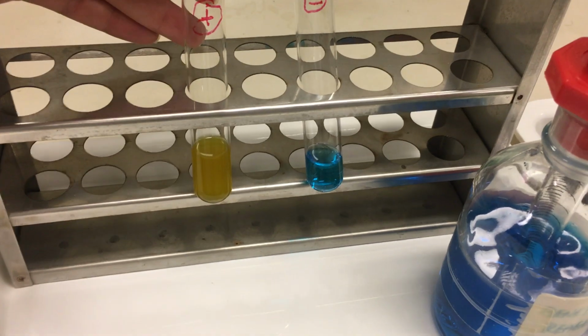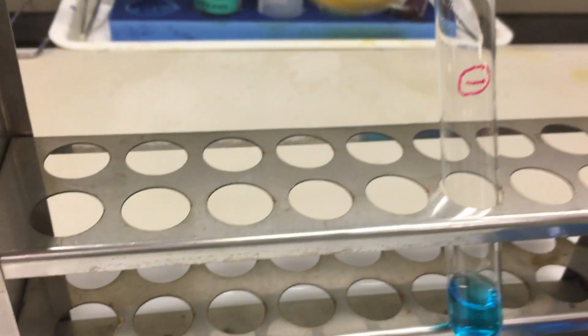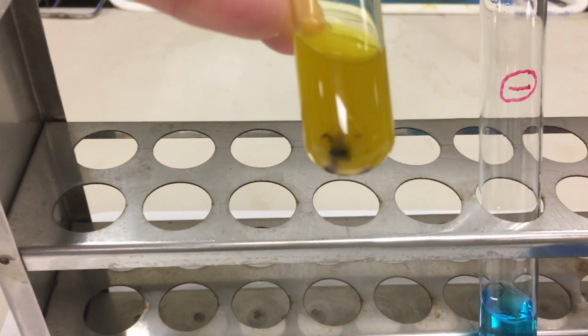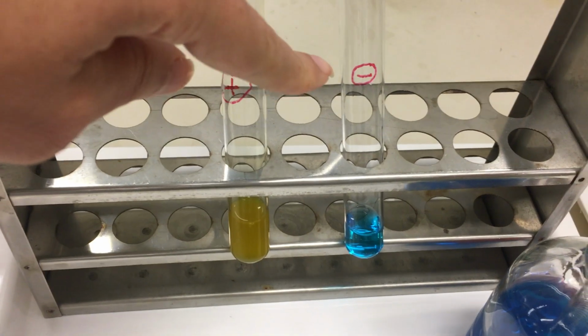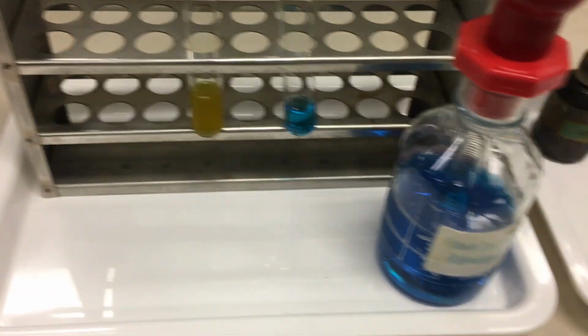It's going to be an orangish color if your unknown sample includes sugar, because of the precipitate of the copper you are going to see, and it's an orange color. And if it stays blue, that is a negative result. It means that your sample doesn't have glucose.